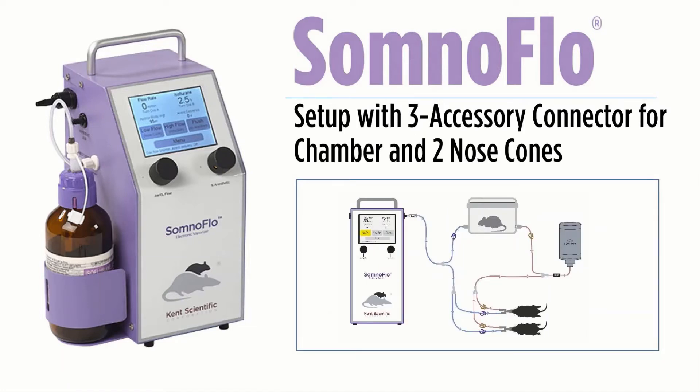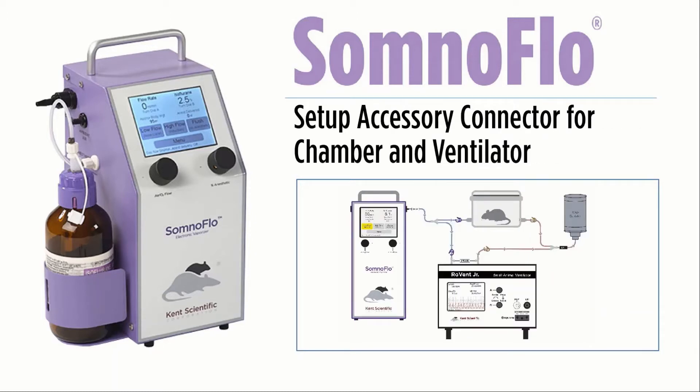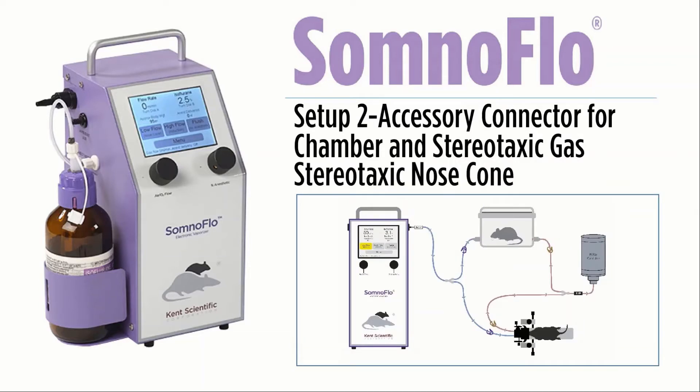The SomnoFlow allows for multiple setup configurations. Our three-way accessory connector allows you to add a third station for higher volume laboratory needs. The SomnoFlow can also be easily utilized with ventilation for more advanced surgical procedures, as shown on your screen. Additionally, it is easily adapted to fit a variety of stereotactic stands, requiring a small increase in airflow to account for the stereotactic fit.